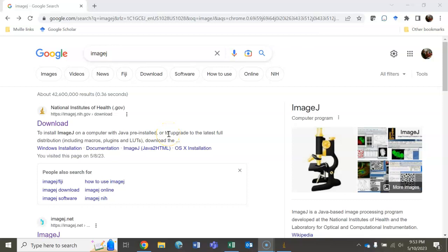Welcome to this tutorial on how to use ImageJ to measure cell length. The first thing you're going to have to do is download ImageJ to your computer.